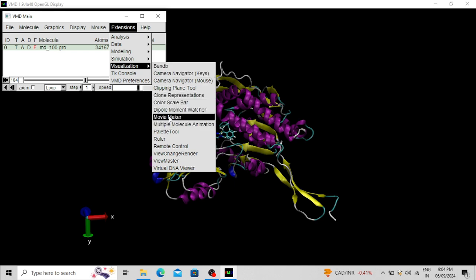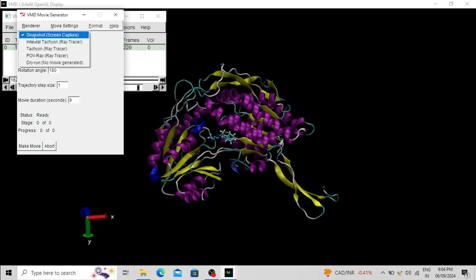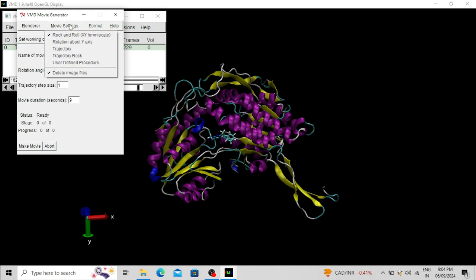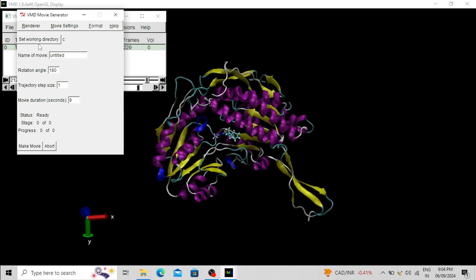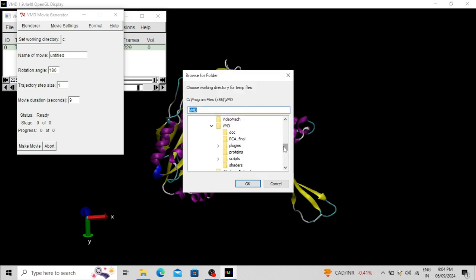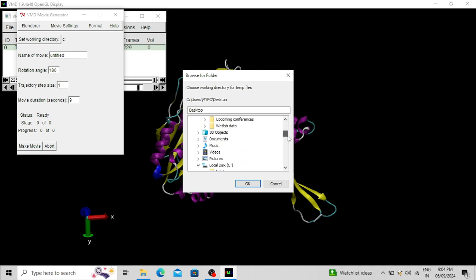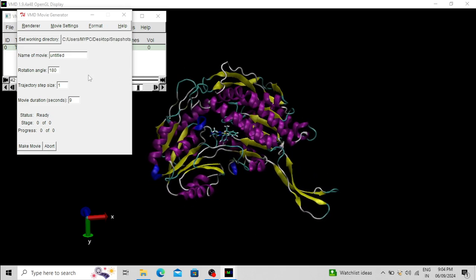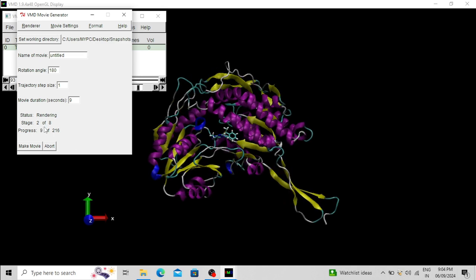In Movie Maker, set rendering to Snapshot. Under movie settings, toggle the Delete Image option and set the format to MPEG video format. Now set the working directory — I am selecting the folder on my desktop called 'snapshot' where the snapshots will be saved. Click Make Movie. You can see the snapshots are being saved.